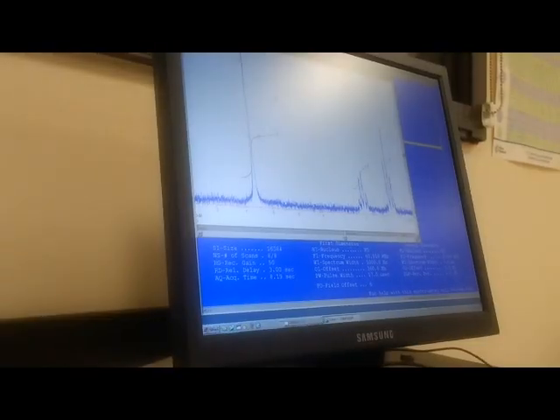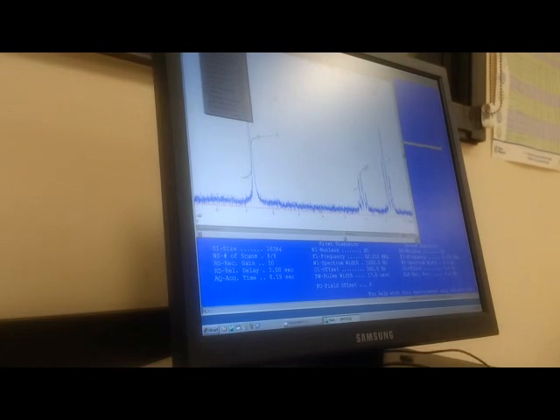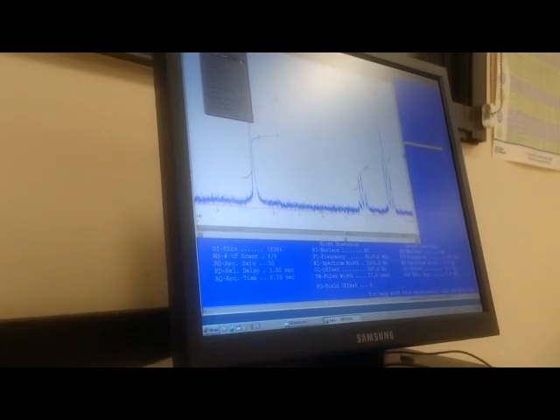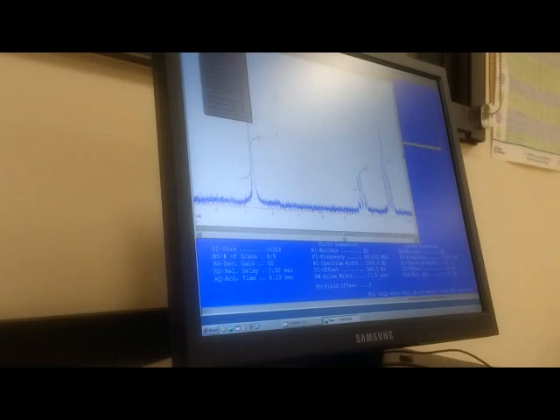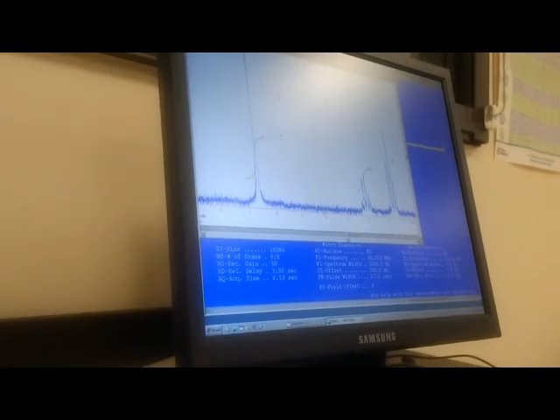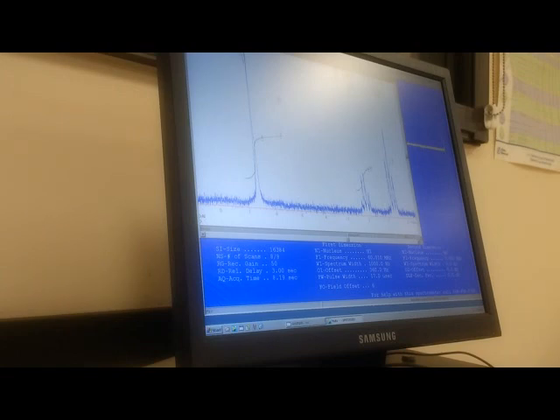Once you're done with peak picking and integration, you want to go to View and choose Show Integral as well as Show Peak Labels. And that'll show the labels and integration curves that you've just created. And then now you're ready to print. Now, we wish we had a printer here. We actually don't.